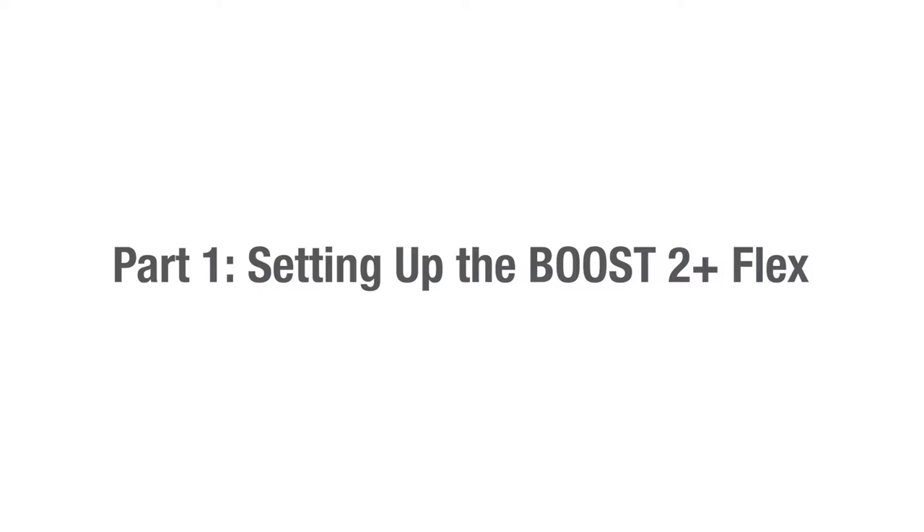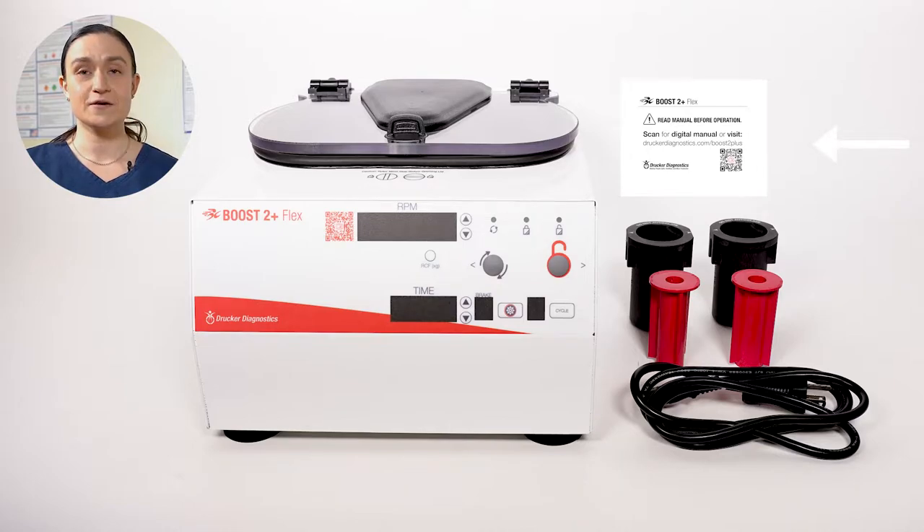Setting up the Boost 2 Plus Flex. To start, make sure that your Boost 2 Plus Flex arrived with all of its necessary accessories. These accessories will come out of the smaller cardboard box packed in with your Boost 2 Plus Flex. You should have a power cord, a quick start insert guide — that's also your link to the manual — and two black buckets. Depending on what you selected when you purchased your Boost 2 Plus Flex, you may also have two or more inserts.